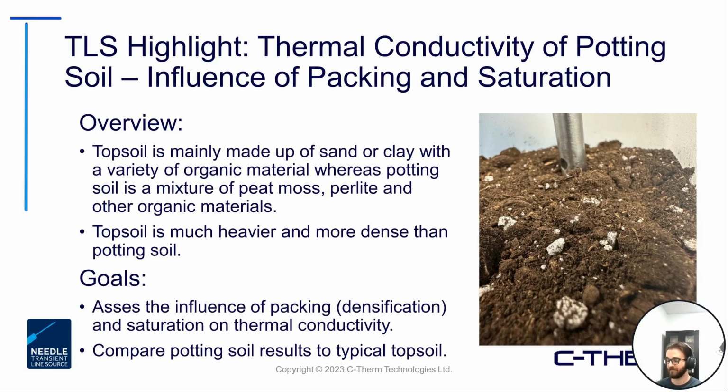But because of that, inherently the topsoil's heavier, denser properties, you will generally expect to see some differences if you're just testing them in similar scenarios. But again, for an example here today, hopefully to illustrate the point, the TLS was used for these different types of potting soils.